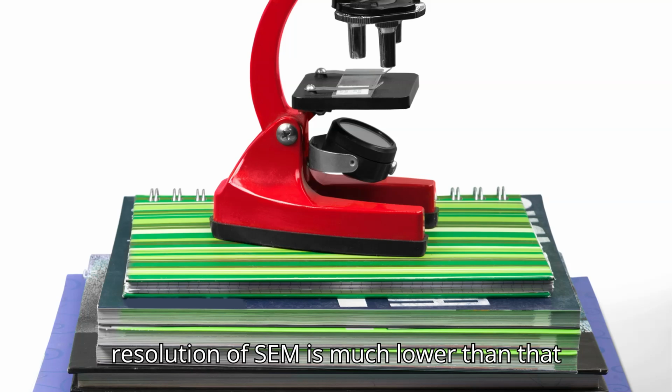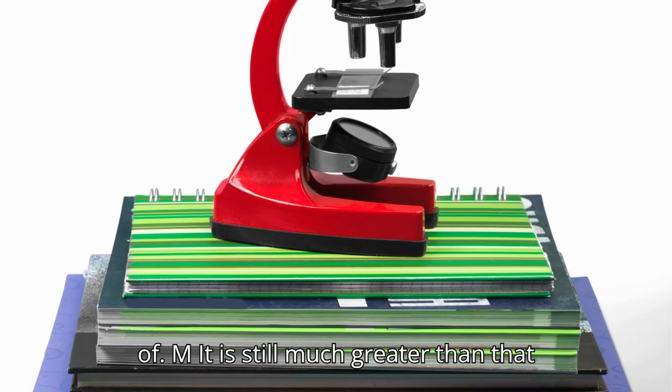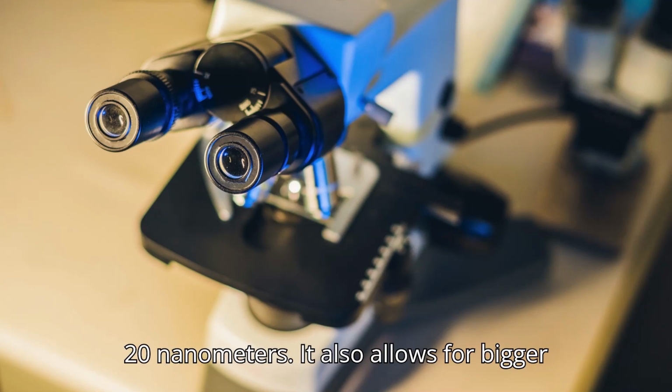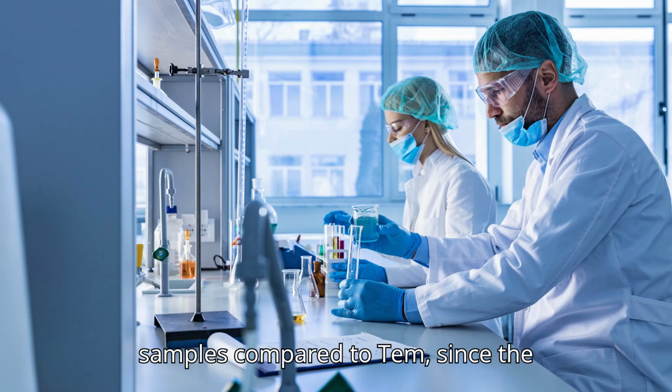Even though the resolution of SEM is much lower than that of TEM, it is still much greater than that of a light microscope. It runs from 1 to 20 nanometers. It also allows for bigger samples compared to TEM, since the specimens need not be sliced into ultra-thin slices.